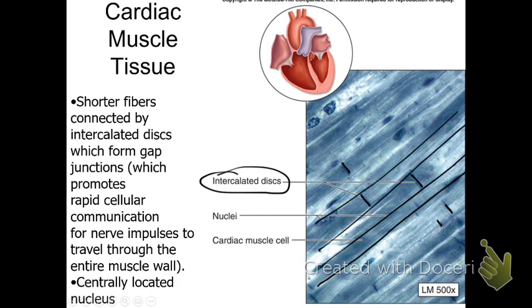You see long, striated cells. But you also see these intercalated discs. Now, to me, this looks like bamboo. I mean, it looks like bamboo shoots, doesn't it? And these intercalated discs would be those, the lines that you see in bamboo. Now, the way I remember this is silly, but the way I remember this story is, what animal eats bamboo? Right? We see the bamboo appearance. What animal eats bamboo? We all think of panda bears, and of course, everyone loves pandas. So by love, you come back to the heart. Again, I just want to give you silly little, quirky little stories to help you learn how to recognize these tissues.